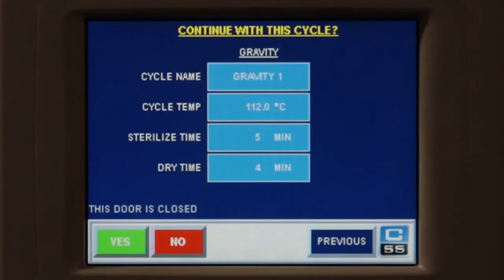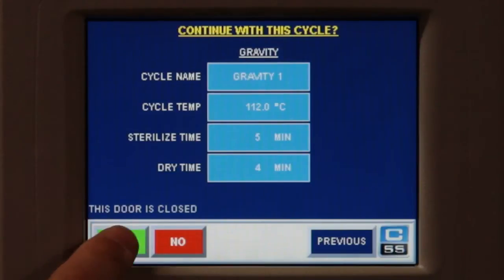Once the door is closed and you have double checked your cycle parameters, press yes and your cycle will start.